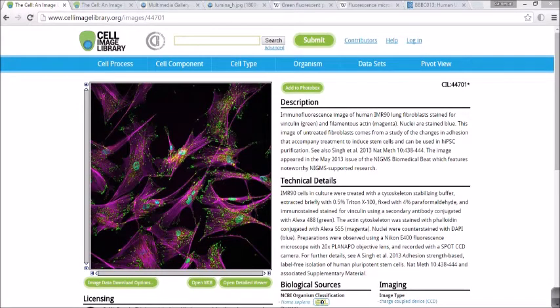I'm going to introduce fluorescence microscopy and computational processing and analysis of biological images. Fluorescence microscopy is a very useful technology in cell biology. The special thing about fluorescence microscopy is that glowing labels emphasize the subject against the background, increasing the resolution of the image. For example, this image represents mammalian fibroblasts with multiple fluorescent labels.